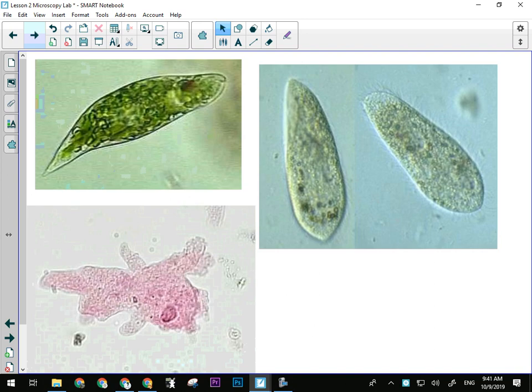Okay, here we go. So the amoeba, I already showed you one picture of an amoeba. This is another amoeba. Just like snowflakes, no two amoebas look the same. And you can see here, there's a bit of depth, right? The front of it and the nucleus is kind of in focus, but this little pseudopod and this pseudopod back here are out of focus. Still part of that amoeba, but it's got a lot of depth.